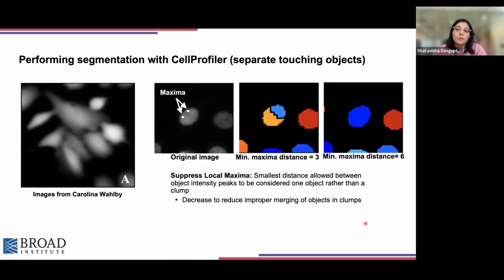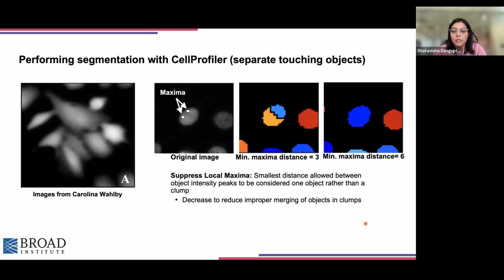There is also the concept of local maxima, which is basically the minimum distance we allow between two intensity peaks within a same object to be counted as the same object or as two different objects. If we increase the maxima distance, it will ensure that an object is not split unnecessarily. And if multiple objects are getting clumped together or there is undersegmentation, we just need to decrease the maxima distance to overcome the problem of undersegmentation.